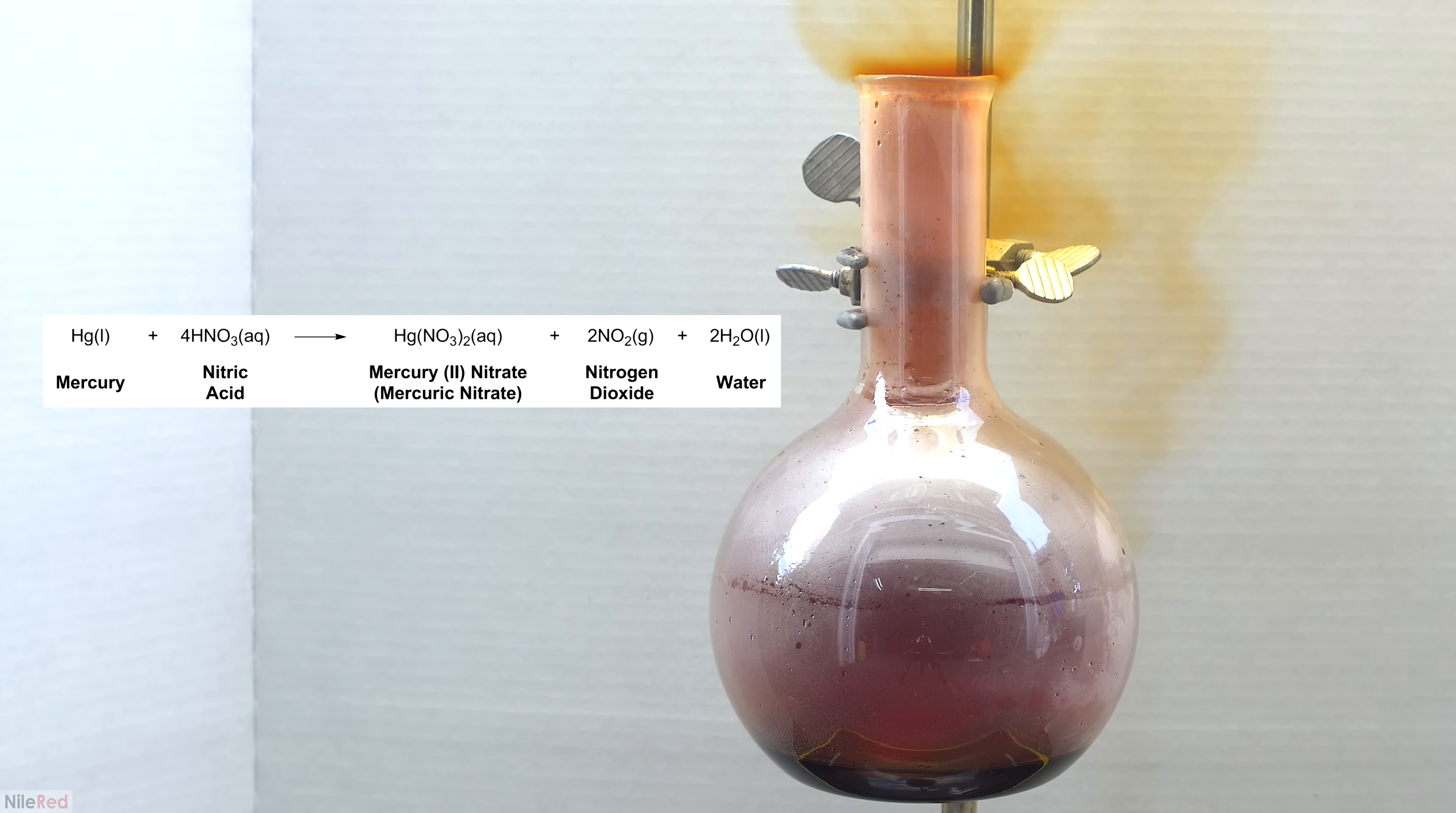Nitric acid is both an oxidizer and an acid, and because of this, it reacts with a lot of metals that other acids won't. You can see here that a strong reaction occurred when the nitric acid and the mercury were mixed, but if we were to add mercury to let's say hydrochloric acid, not much would happen.